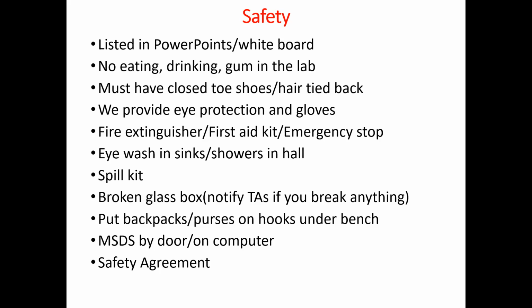In one of the sinks, there's an eye wash that we'll demonstrate in class. There are also eye washes in the hall on either side of the lab, as well as showers if you really have a problem with chemicals. There's a spill clean-up kit up front. Most of the time, paper towels are sufficient for our small spills. In the corner of the lab by the fume hood, there's a broken glass box, but let us know if you break anything. You do not put cuvettes or paper towels or anything in here, only glass.